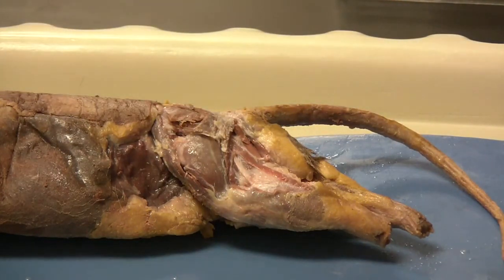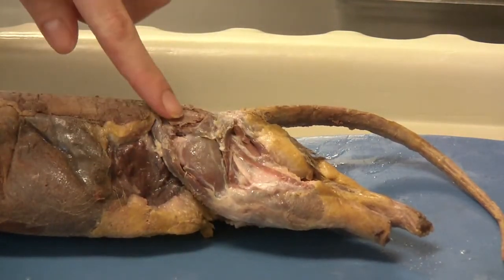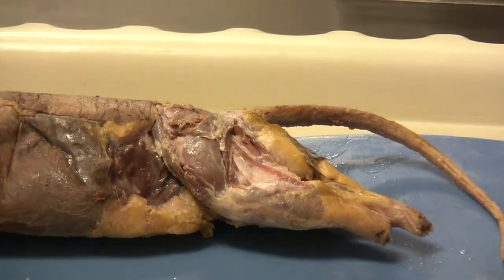So now you should be able to very easily identify the vastus lateralis and the tenuissimus. We have exposed the gluteus medius and followed all the instructions on page 37 in your lab manual.